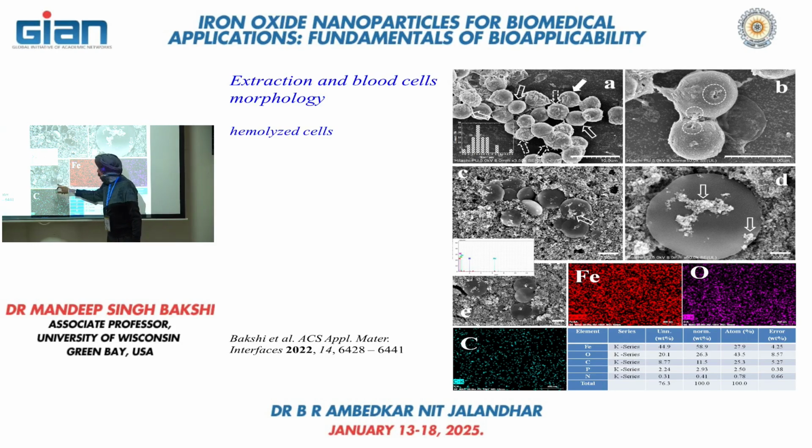We can perform the mapping and you see the proof. So this area is actually covered by the iron oxide nanoparticles. This is the mapping for the iron, this is the mapping for the oxygen, to confirm that indeed all the particles which are present are made up of iron oxide.